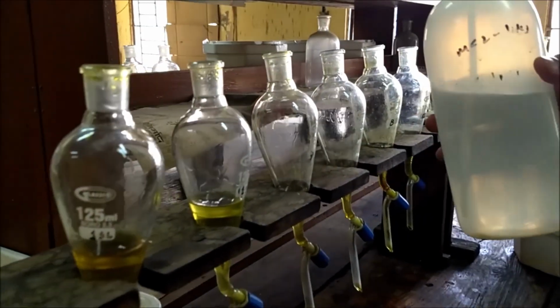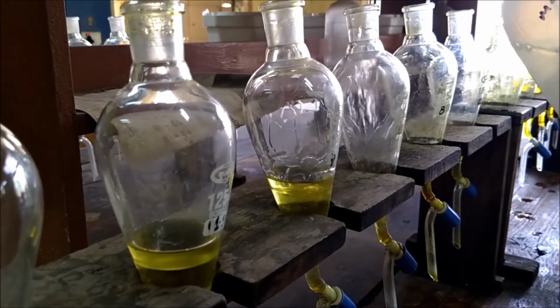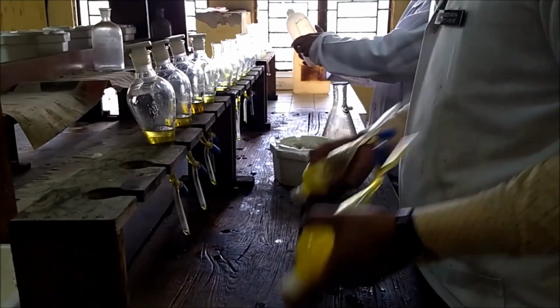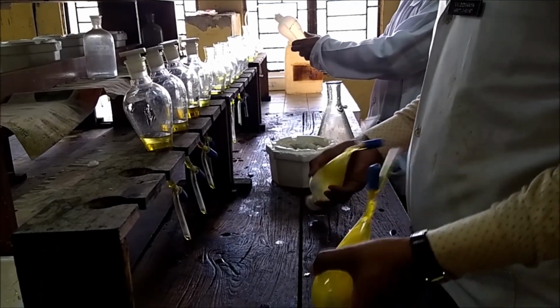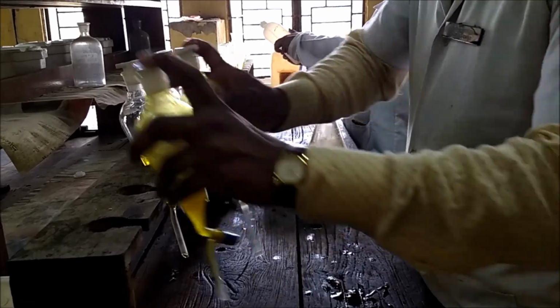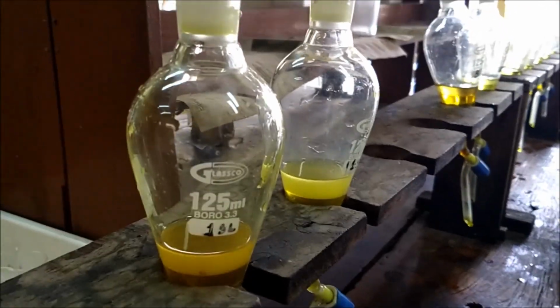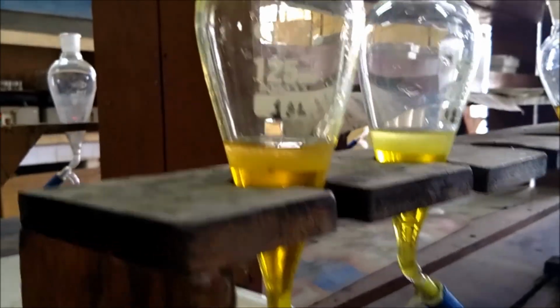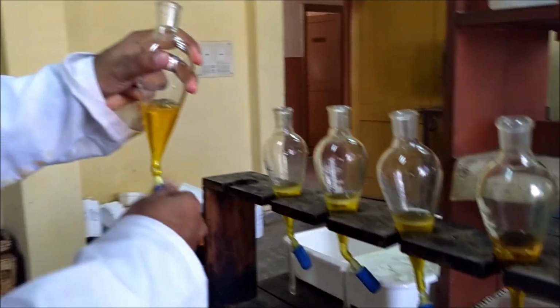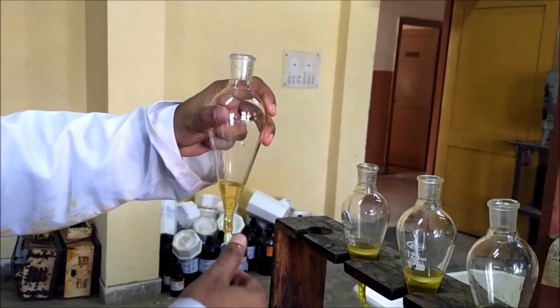Then washing is done with 5% HCl solution, and the same procedure for shaking will be performed, but this time for 30 seconds only. After 30 seconds, we will observe that the color of the organic phase becomes lighter and lighter, while the aqueous phase becomes colored. This is due to the leaching of iron particles into the aqueous phase by 5% HCl.